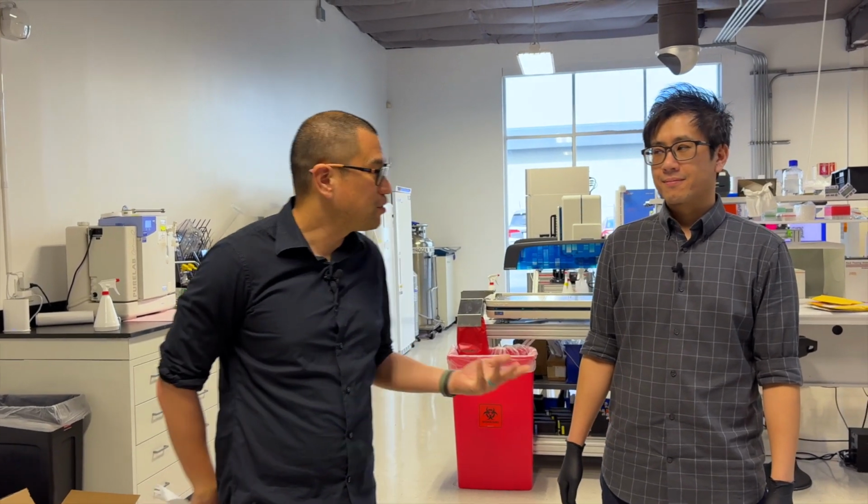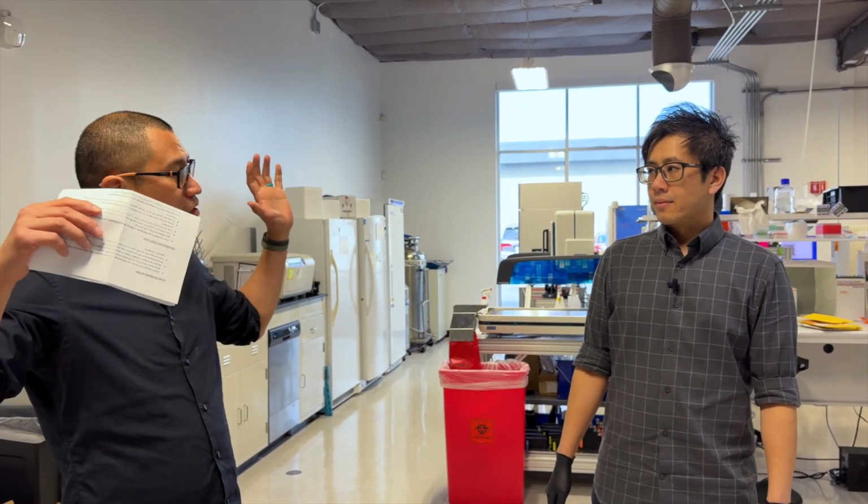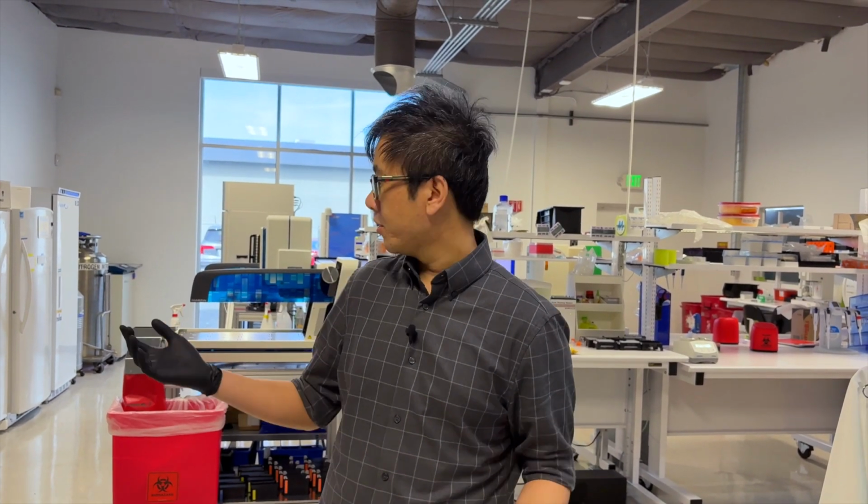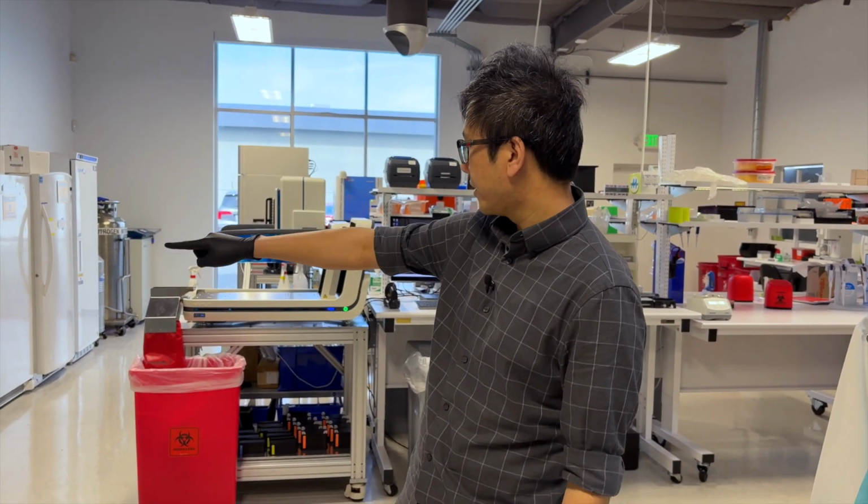All right, so here we are at Eigen Therapeutics wet lab. Transon, would you like to give us a high-level overview, and then we can dive deeper into each of the different sections of the lab? Yeah, sounds good. So welcome to our lab. For those of you that have seen biolabs, some of you may be used to a lot of fixed furniture in place. We do have some fixed furniture, as you'll see some of these classic lab shelves that are up against the wall.